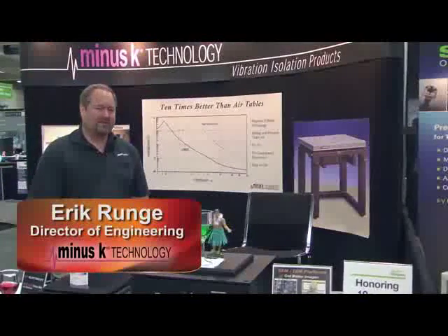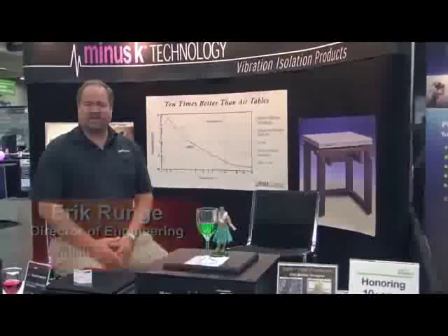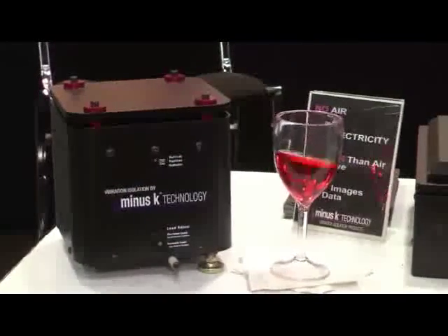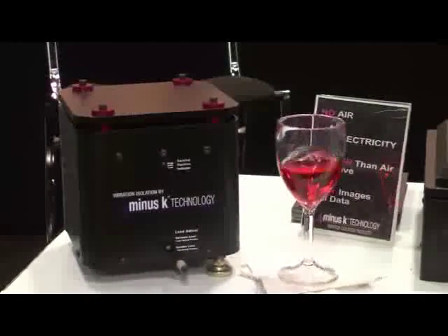Hi, my name is Eric Rung. I'm with Minus K Technology, and I'd like to talk with you about our vibration isolators. Minus K Technology was incorporated in 1993. Our isolators are all half a hertz, totally passive vibration isolators.